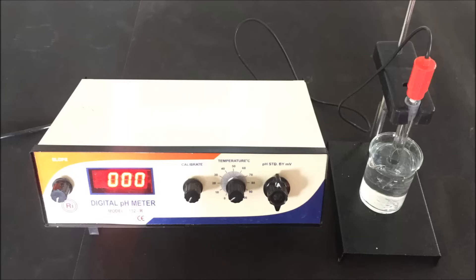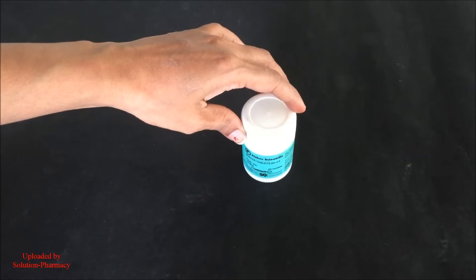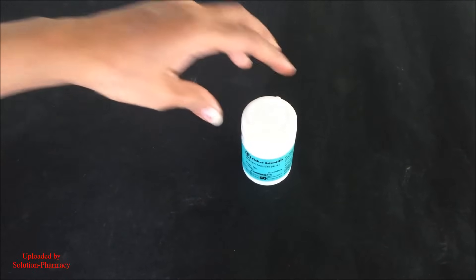Now the working procedure of the pH meter. Before measuring the pH of a test sample, we first have to calibrate the pH meter for accurate measurement. For calibration, a standard buffer solution of pH 4 and pH 7 is required. This is the standard buffer tablet of pH 4, from which we prepare the standard buffer solution of pH 4.